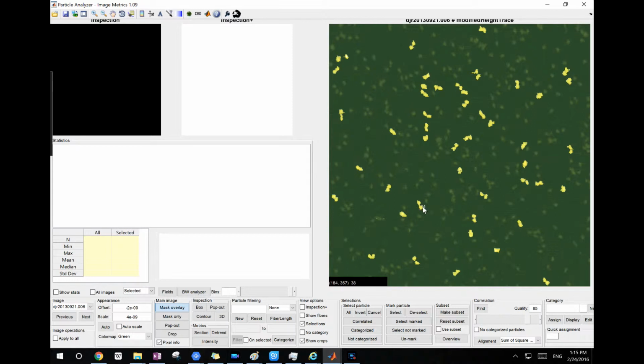If you pick a particle that's generally round in shape, you will find matches that are not quite satisfying, because it does not have any distinctive correlation with other similar round shaped particles.